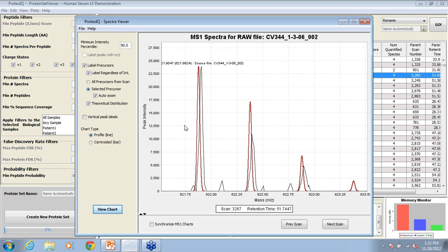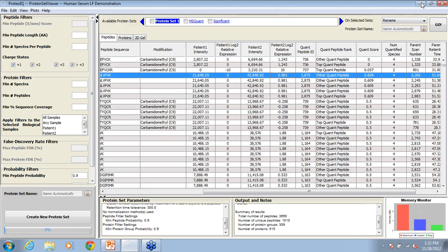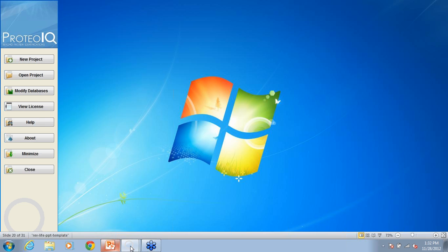Okay. If you have a large shift, sometimes it'll be over here. So that gives you really good feedback as to the error of your actual instrument for that scan. So for the overlap, don't worry, it's corrected for, it's directly lined up, but for display purposes, we keep them separate. Let's jump back in.